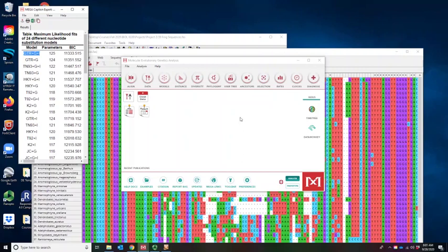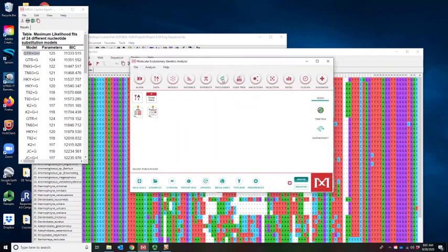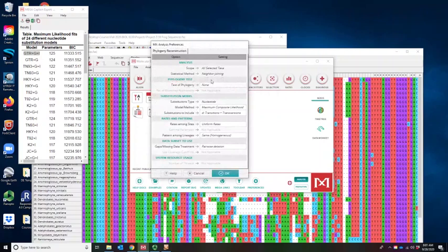Okay, so let's now do a phylogeny. We've already got our data set activated, so all we need to do is come to this option on the main window, again, not your alignment window, and select phylogeny. Okay, and we're going to do 3 quick analyses, and we'll save all of them and do a quick comparison at the end. The first one we're going to do is a very simple neighbor joining test. So neighbor joining, we'll leave everything at its default, and we'll just say OK.